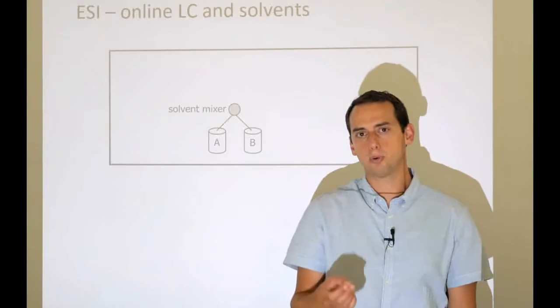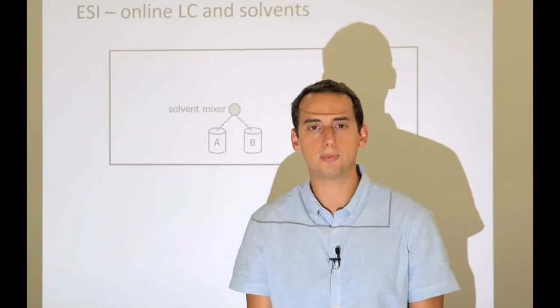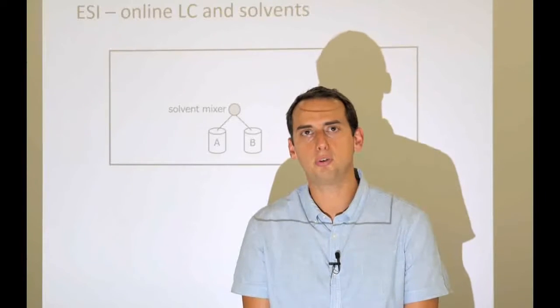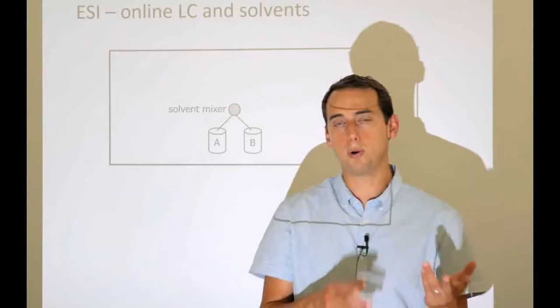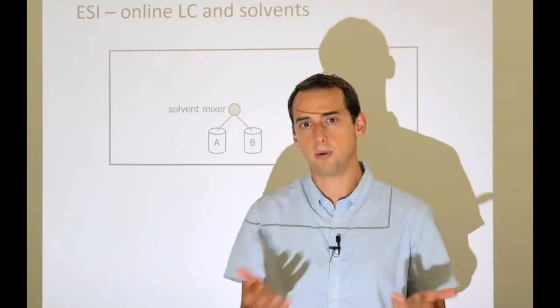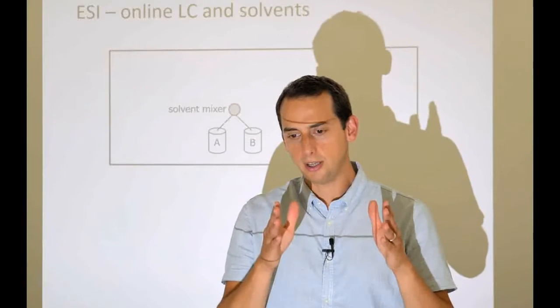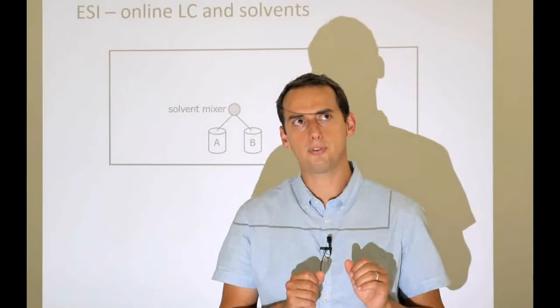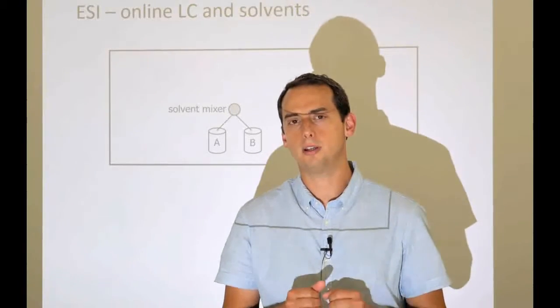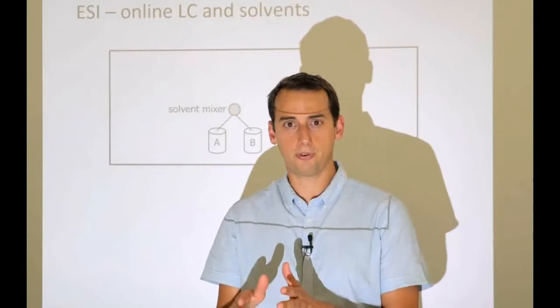These 5,000 proteins, if we cut them into smaller peptides, which we usually do with trypsin, that cleaves after lysine or arginine, which occur roughly one in every 20 amino acids each. So the combination is every 2 out of 20, so every 1 out of 10. That is how we come to this average length of 10 for a peptide. If we have these particular peptides cleaved from a protein, and we have 5,000 proteins, and I can give you the number for human genes, it is roughly 30 peptides per protein, that gives us 5,000 times 30, gives us 150,000 different peptides.